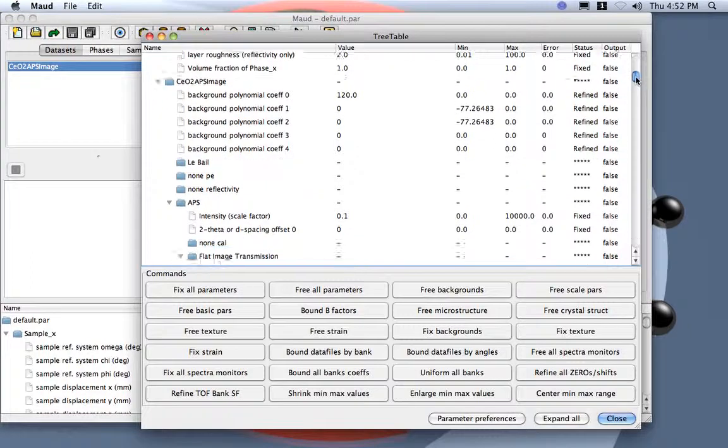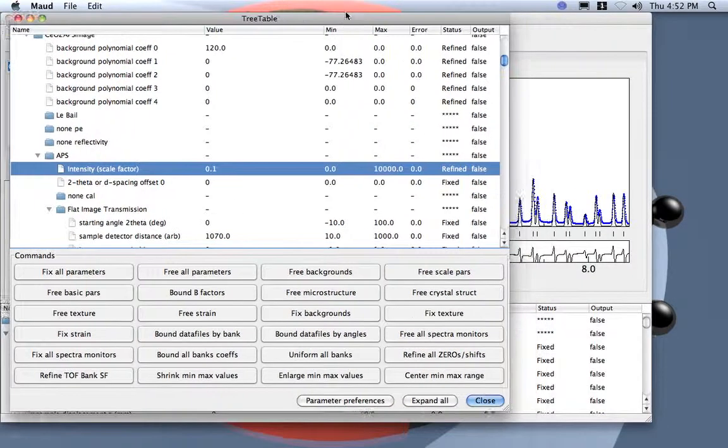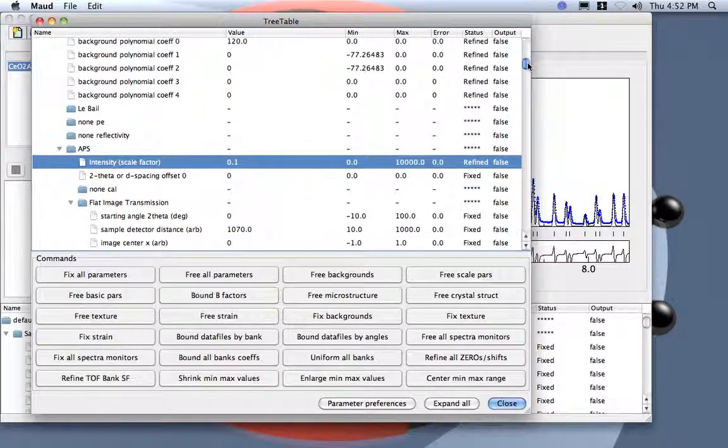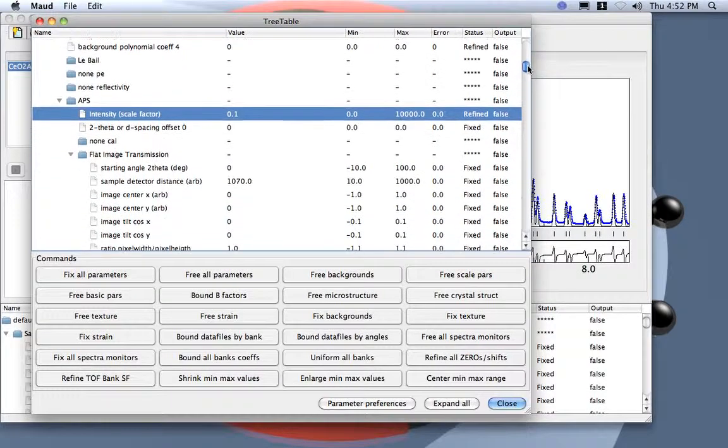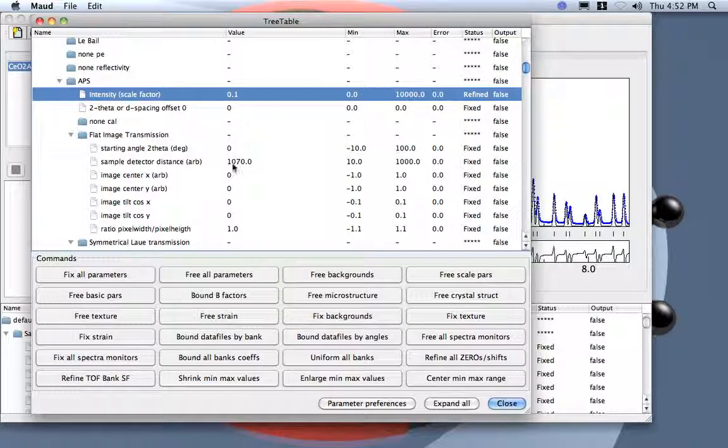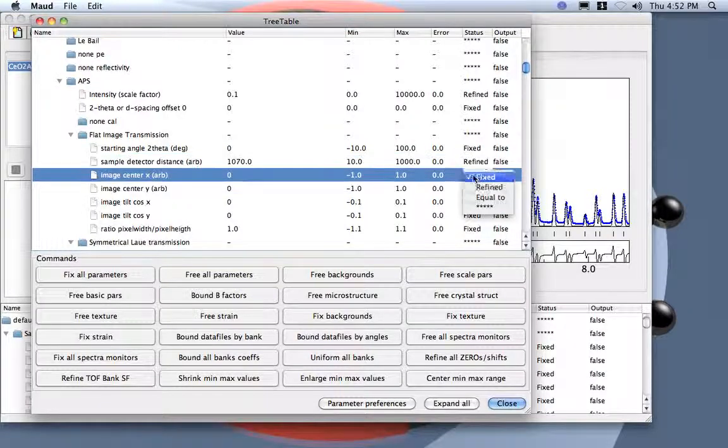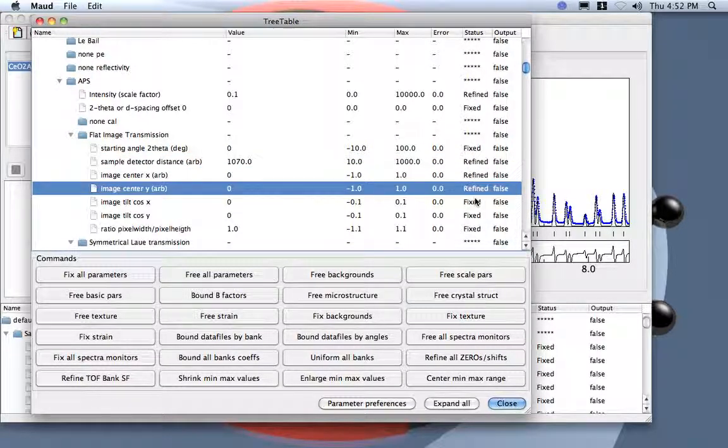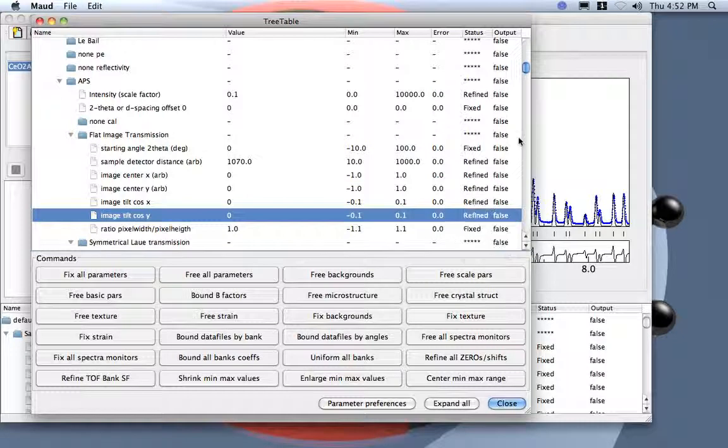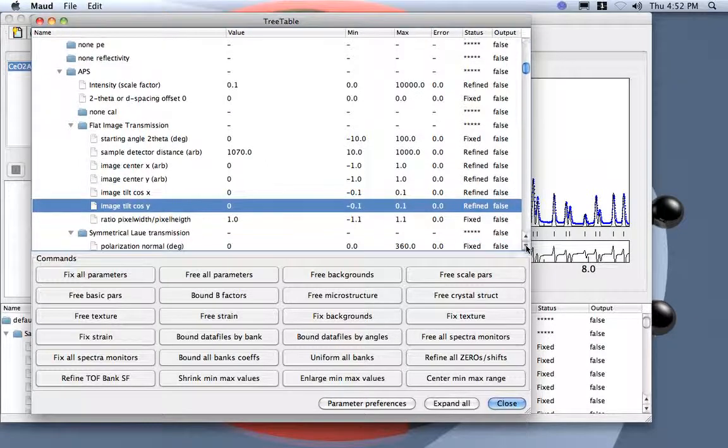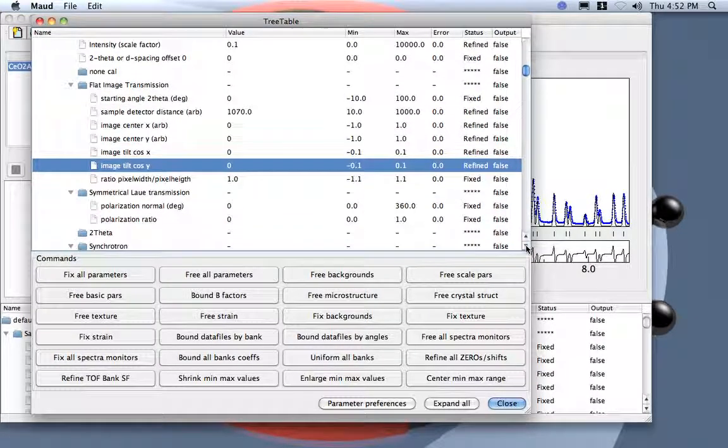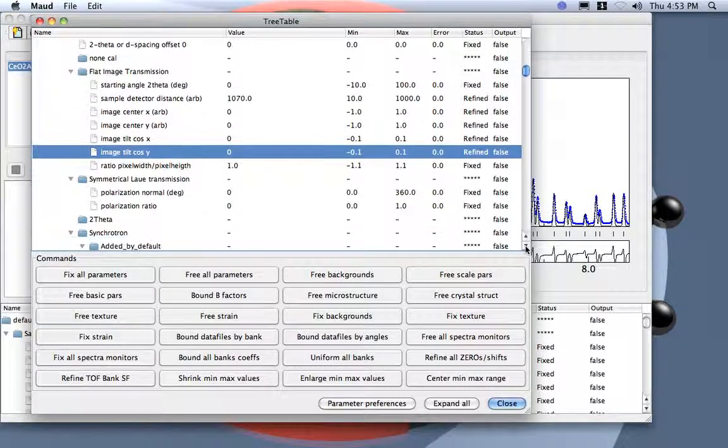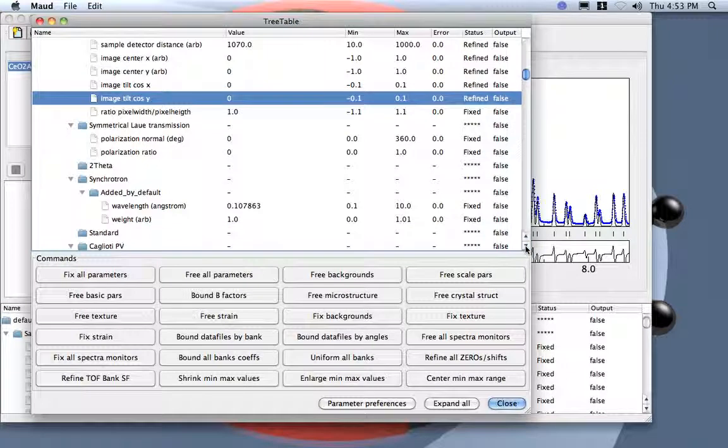Now I want to refine the intensity. So background and intensity for sure. And then I need to refine the calibration. What I want to refine is the sample detector distance that we don't know correctly, the center X and center Y, the error on it, and the tilting of the detector. Always refine also the tilting. You will never get a perfect detector at 90 degrees with respect to the beam. It always has some error. It is impossible to put it correctly.